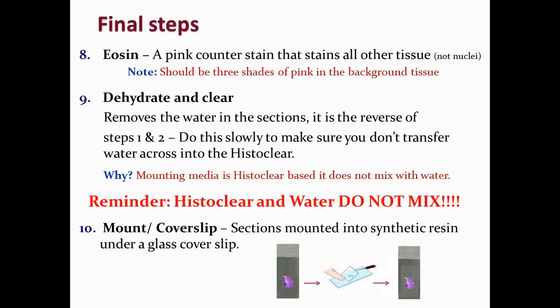These sections need to be mounted with a synthetic resin, in our case DPX, and then a glass cover slip placed on top. Make sure you ask your teacher to explain to you how to get the bubbles out before the following week. If the resin sets, you will not be able to get the bubbles out and the slides will be destroyed over time.